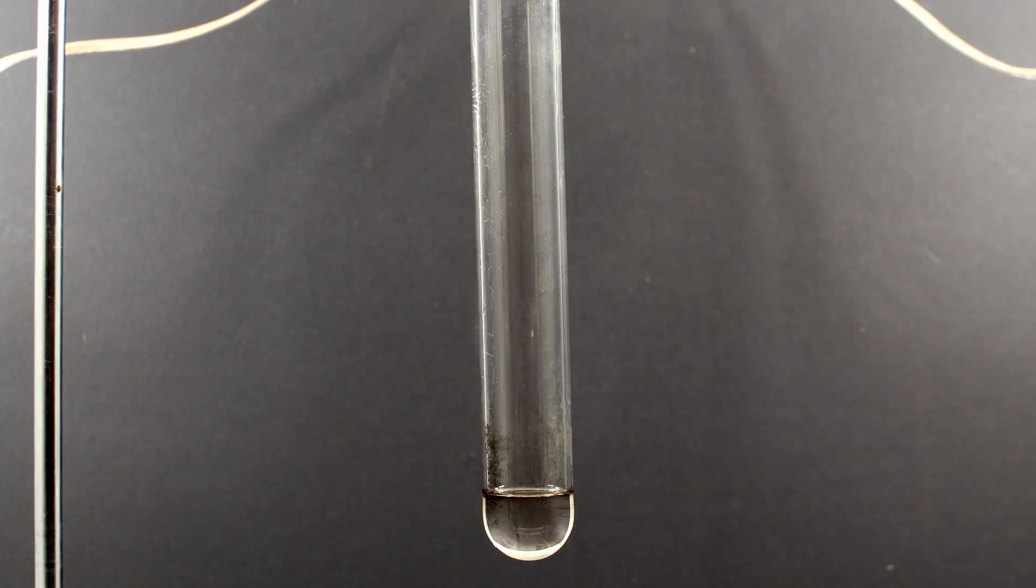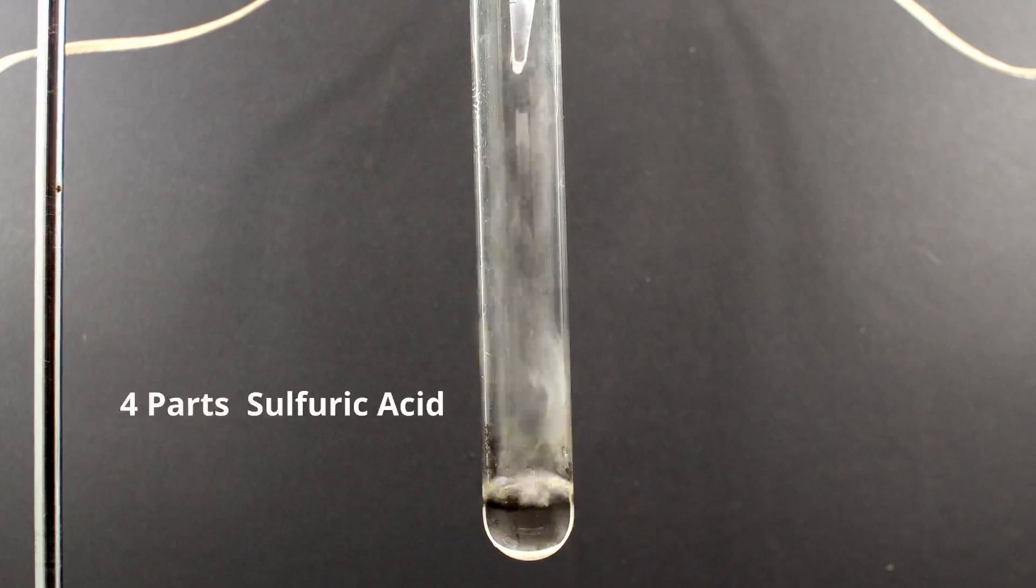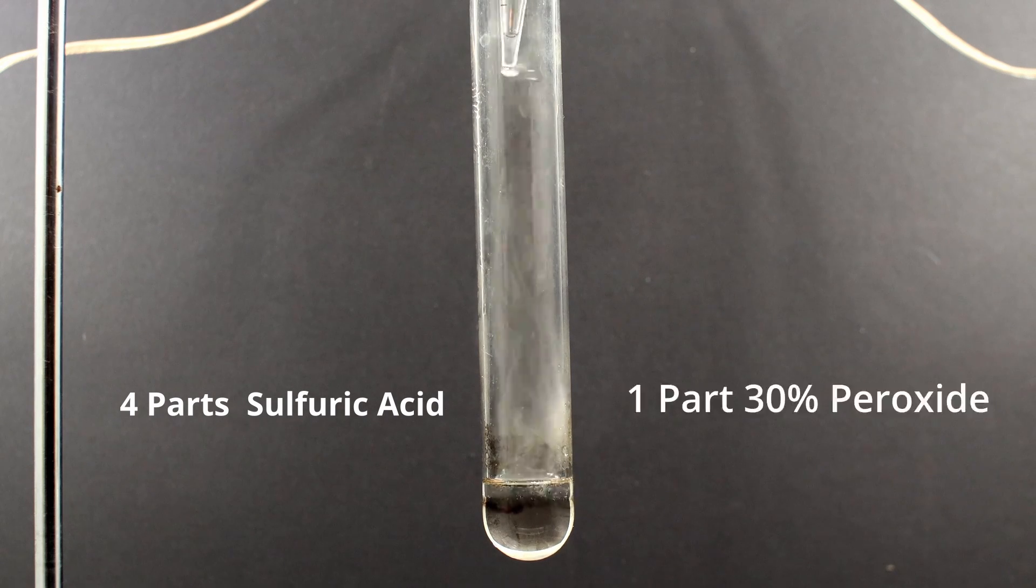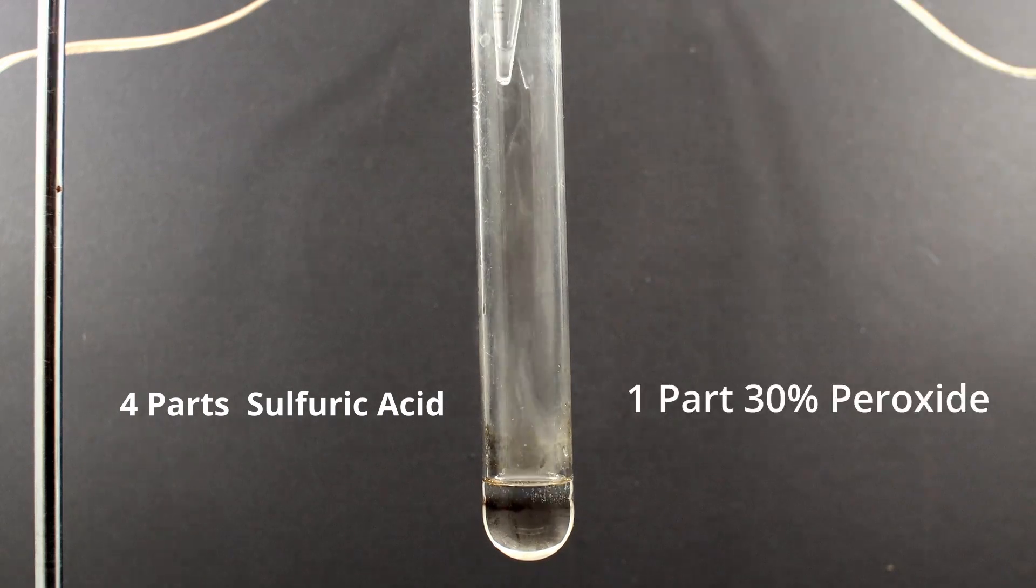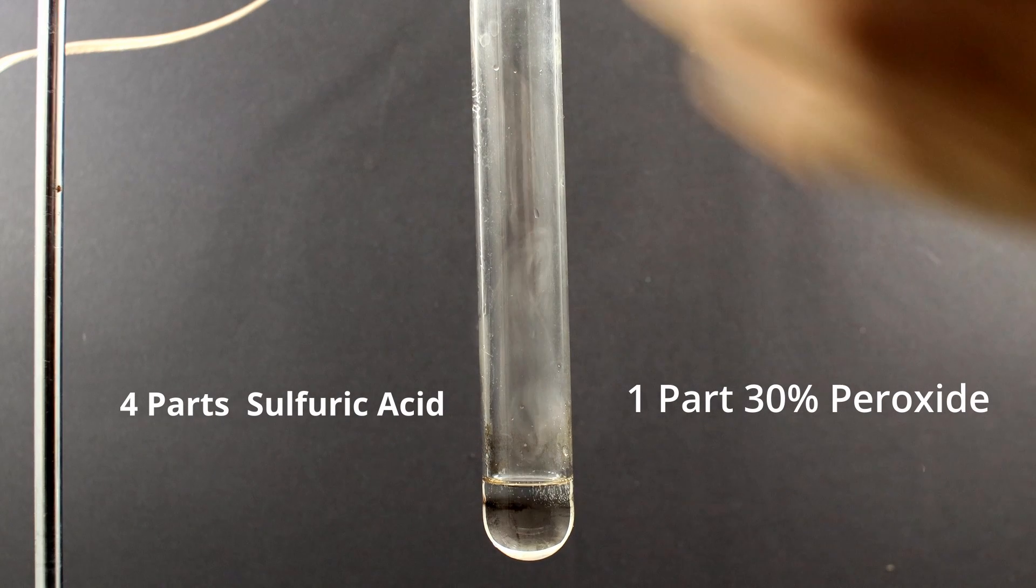But if we start out with a solution of about 30% hydrogen peroxide, we can go ahead and add it to the sulfuric acid in a ratio of about 4 parts sulfuric acid to 1 part hydrogen peroxide. Do not go too crazy with the hydrogen peroxide, because it could literally blow up if you add too much.